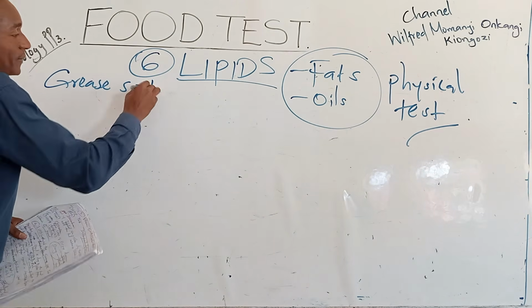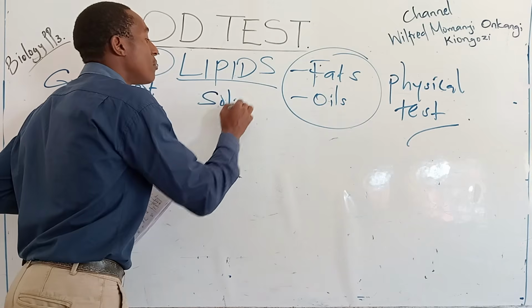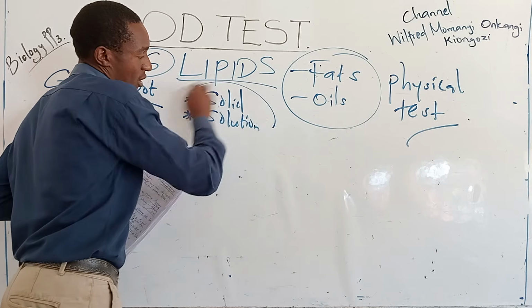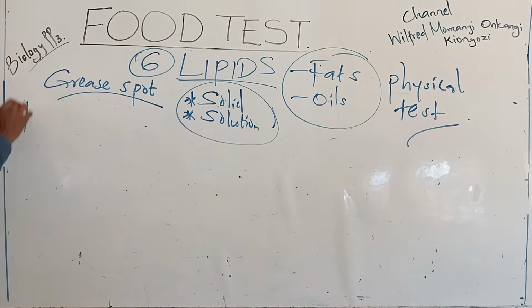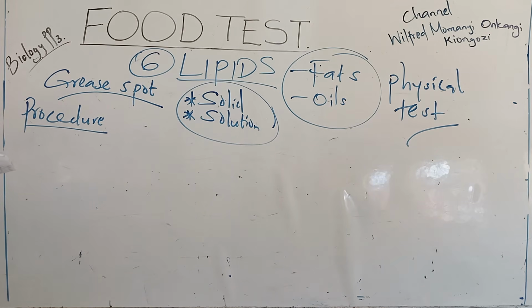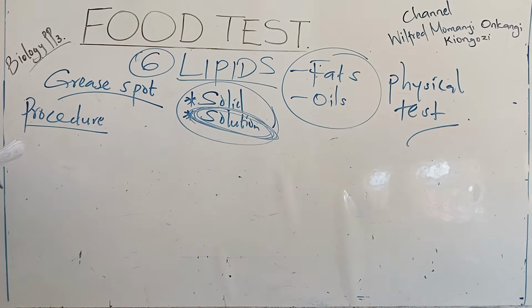Grease spot. The food that you are testing, whether it has lipids or fats, that food can either be in solid form or solution form. So that will dictate how I'm going to write the procedure for the test of lipids. So procedure. I'm assuming mine is in solution form. And most of the time they bring that food substance in solution form.